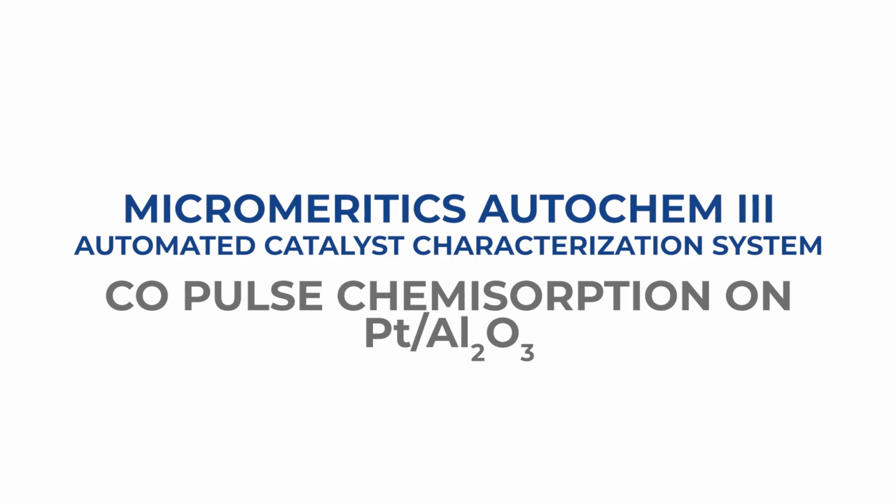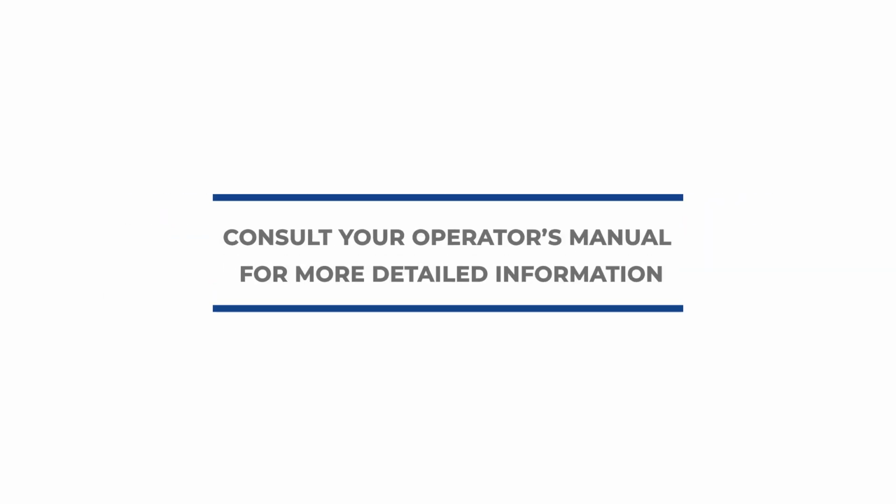This video will show you how to run a carbon monoxide pulse chemisorption analysis with the platinum alumina reference material on the AutoChem III. Remember to always consult your user's manual for further information.